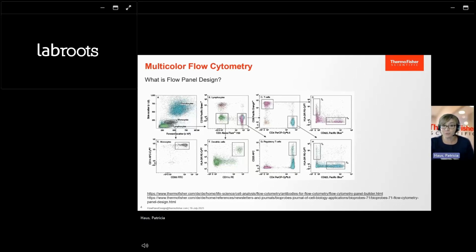So by choosing the products and the conjugates very wisely, you can ensure a very high standard of quality, but also that your data set is accurate. And at the end of the day, it is super important that for each target, the choice of antibody conjugate is made under optimal circumstances.